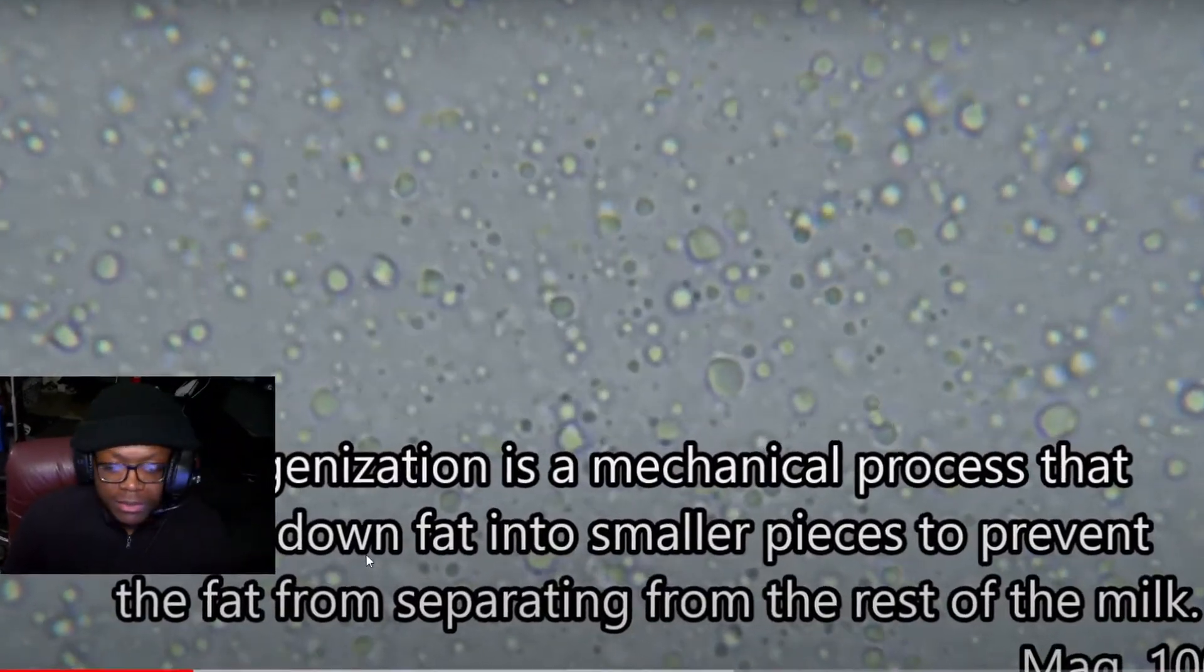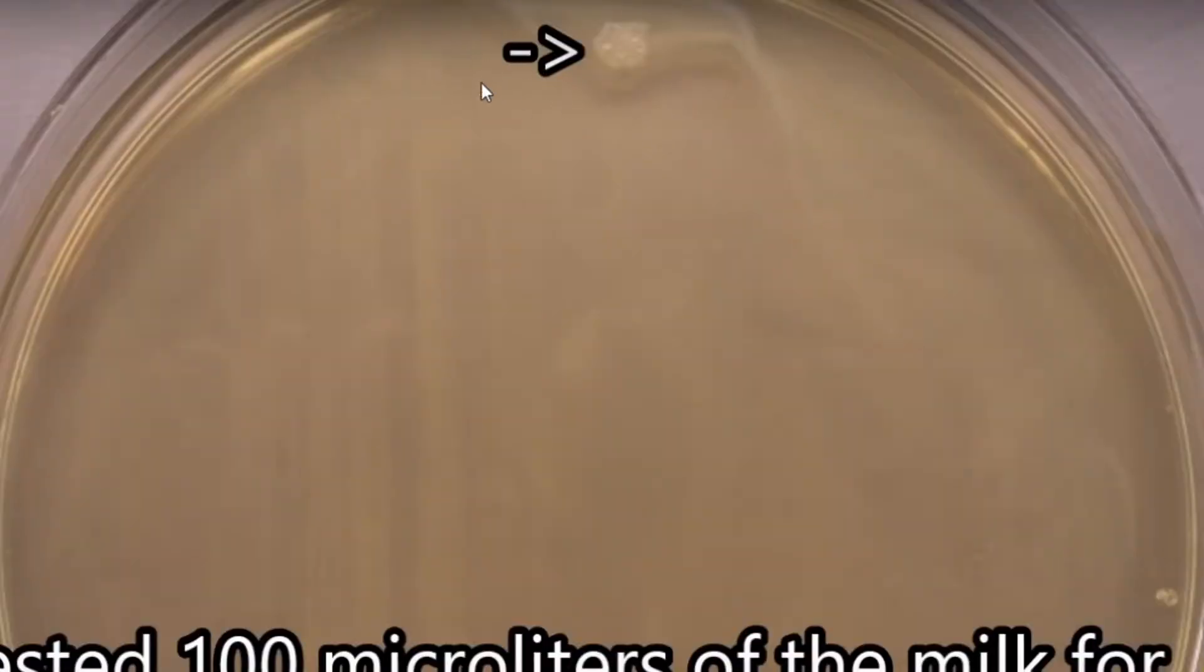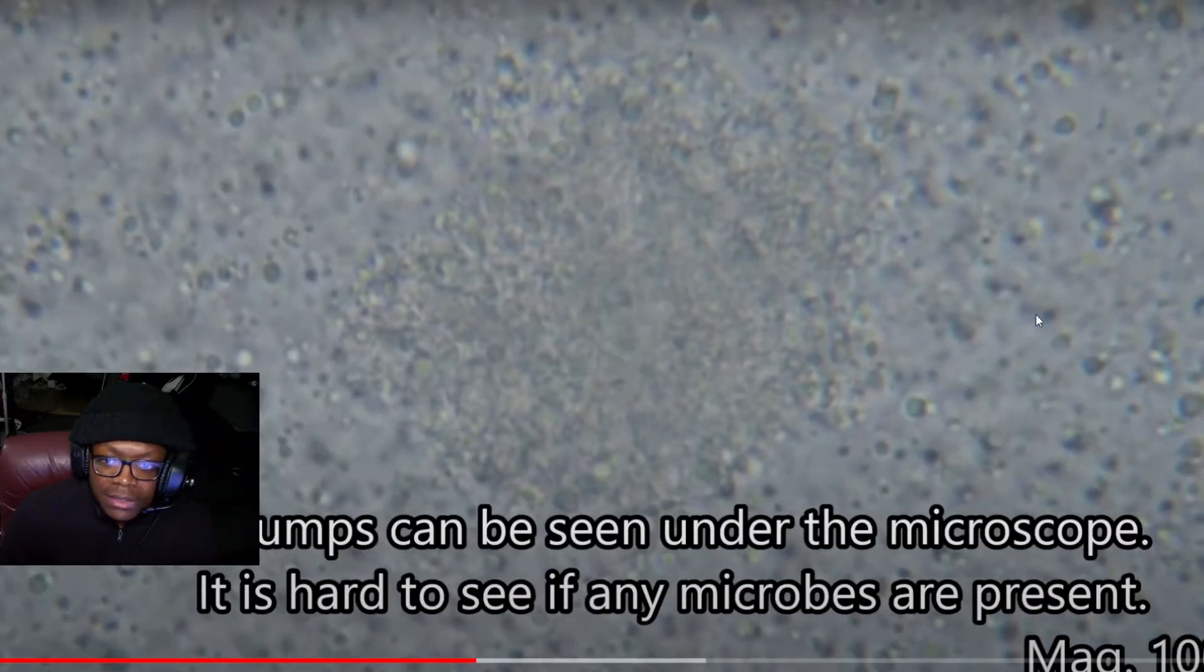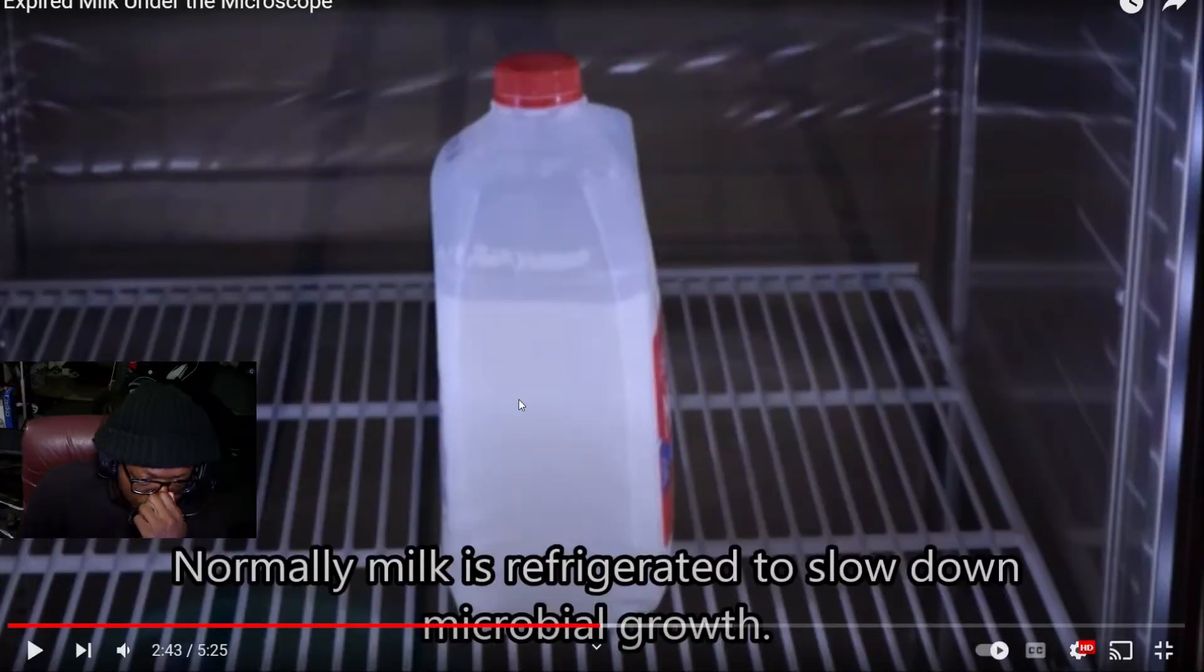Now this is the milk on a petri dish and there's some bacteria. But isn't bacteria present in just about everything? Now this is the expired milk, the curds. We still see the globules and we have a lump of milk here. And look, now we have more bacteria. Refrigeration slows down microbial growth.